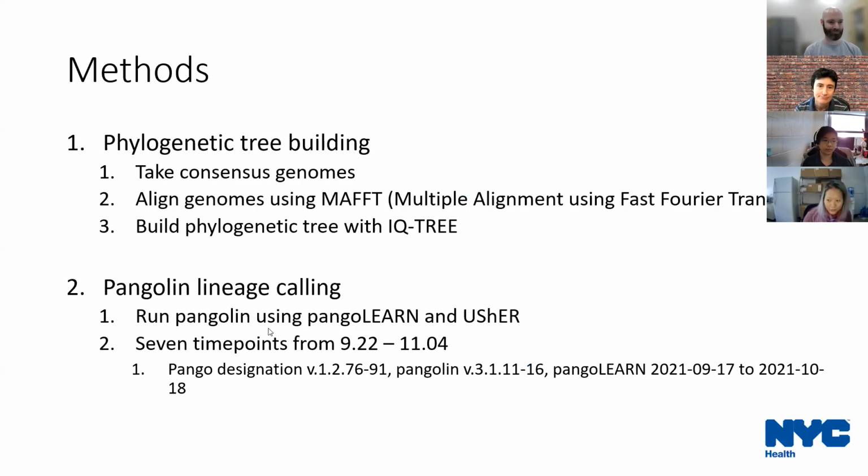This is all, I'm sure, very familiar to you. And then we built a phylogenetic tree. And then we use pangoLEARN to call it. So over the course of like 1.5 months, we called it 7 times.